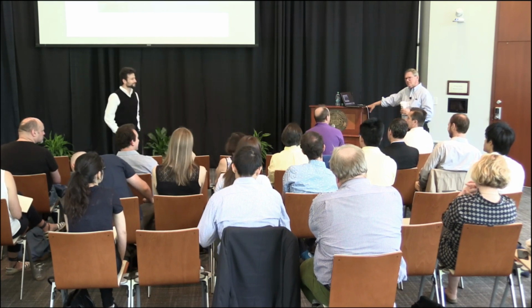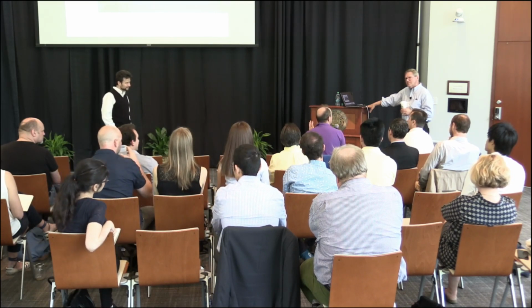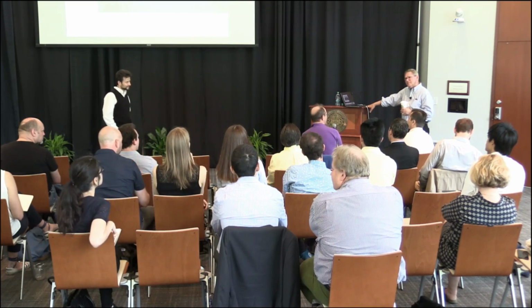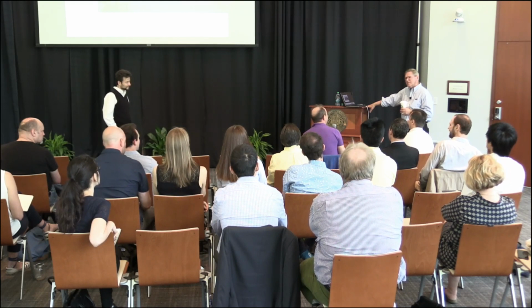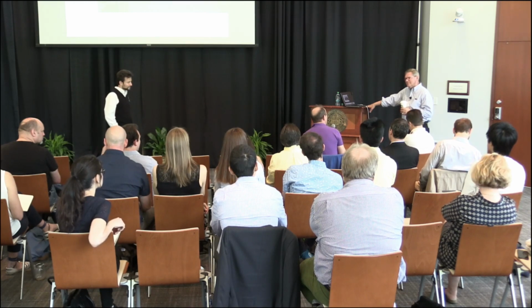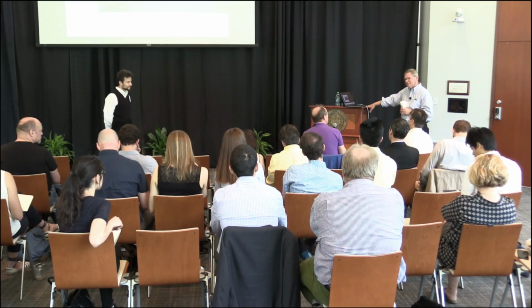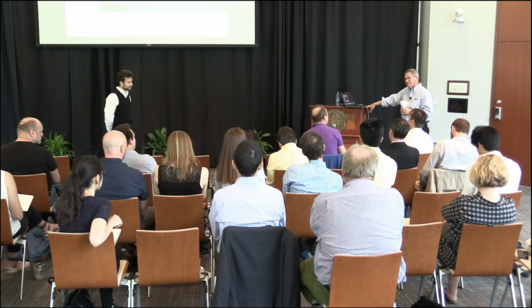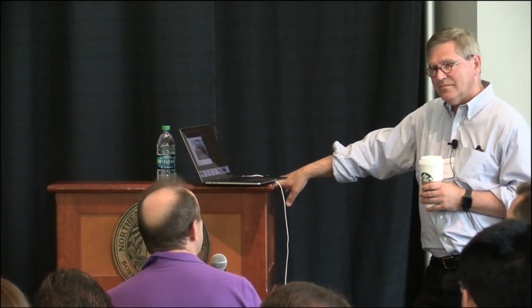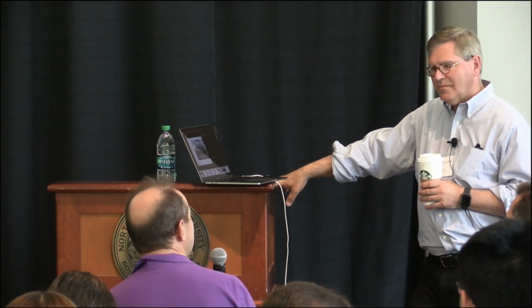Well, that's very interesting. You didn't cover this aspect, when there was a competition with other approaches. Particularly, there was this sequence tag approach, favored by Matthias Mann. For a while there were two competing approaches, and then your approach won because the tag has a big deficiency. It's only 70% reliable. And so your approach is completely blind, and therefore it always works. Could you comment on that part of the story?